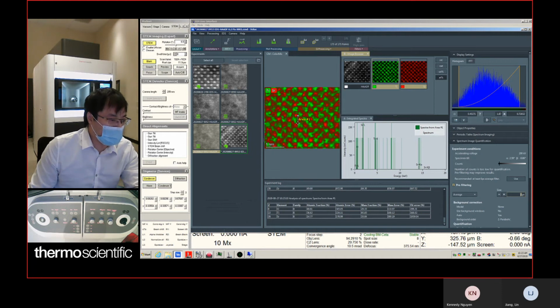So if you do averaging 3, you're gonna extract signal from this 3 by 3 pixel region and then redistribute it into this 3 by 3 pixel area uniformly. In this case, when you select a 1 by 1 pixel area, you're gonna get oxygen signal. Am I clear? Okay. So I think so.